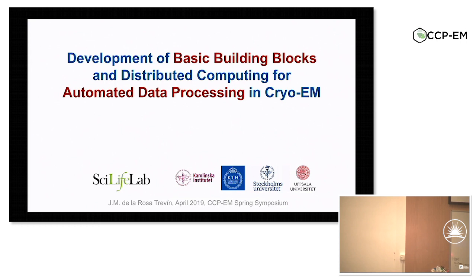So I will start talking a little bit about the work we have been doing in our facility related to automation. And then in this process, I will also highlight some points where I feel we need to kind of review how we're developing software nowadays in cryo-EM and some steps we have been working on as well.